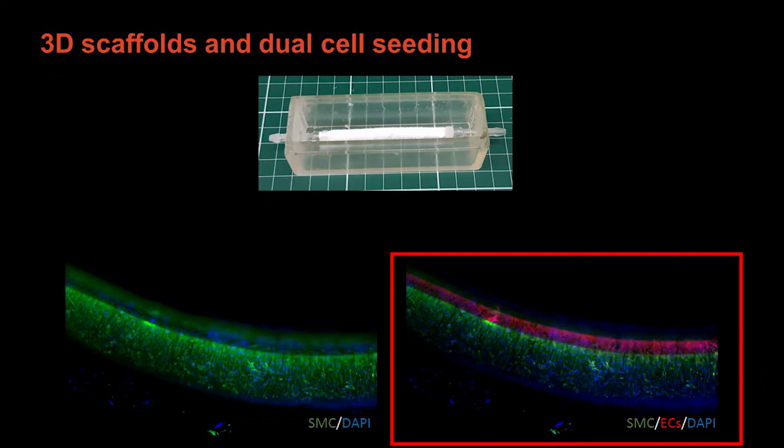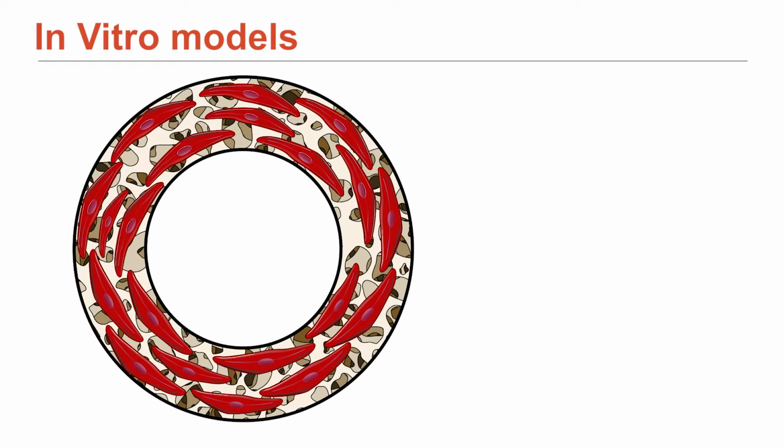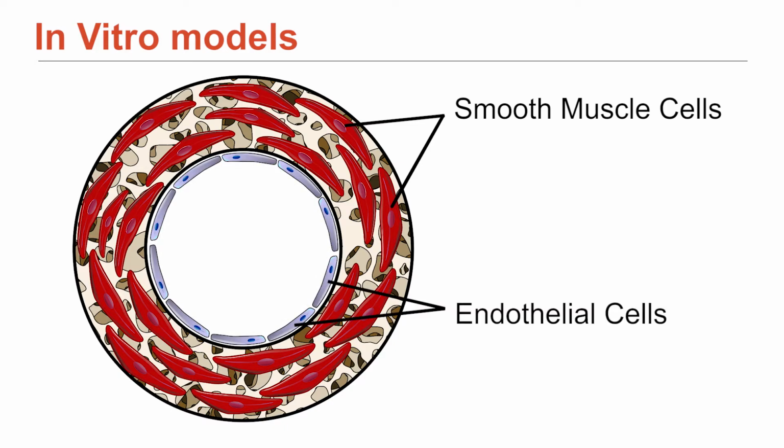We want the endothelial cells in particular to be on the top of the graft in contact with what would be the blood, and we want the smooth muscle cells ideally in the wall of the graft. So the framing of it then is, okay, we've got a 3D scaffold, an electrospun silk conduit. Ideally we want to seed smooth muscle cells in the wall of that graft, so it has to be porous to allow for that. And then we want to put a layer of endothelial cells on top of that to best replicate what we're finding in tissue.